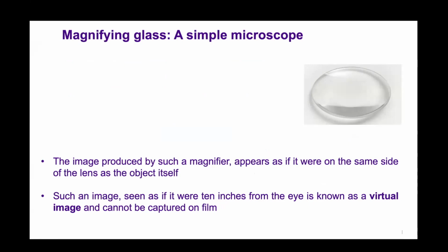To see small things, yes. So to see small things, things that we cannot see with the naked eye. So that's why we need microscopes. The name itself says micro size, like the limitations beyond the eye.